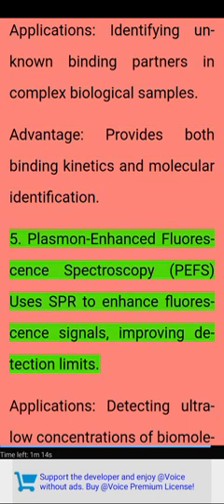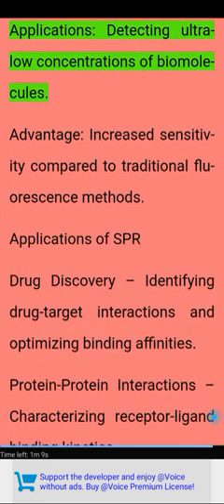5. Plasmon enhanced fluorescence spectroscopy (PEFS) uses SPR to enhance fluorescence signals, improving detection limits. Applications: detecting ultra-low concentrations of biomolecules. Advantage: increased sensitivity compared to traditional fluorescence methods.